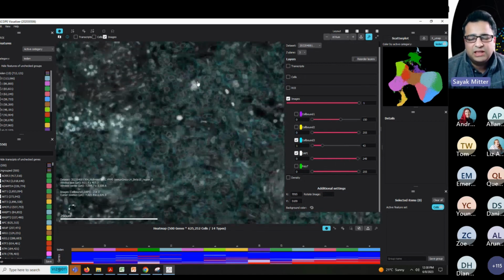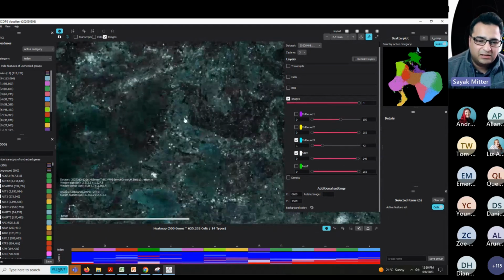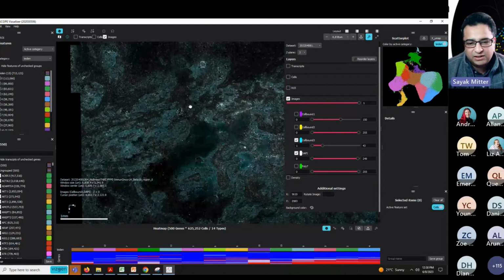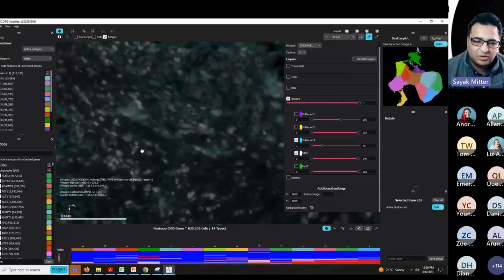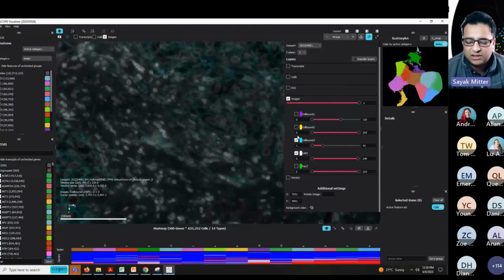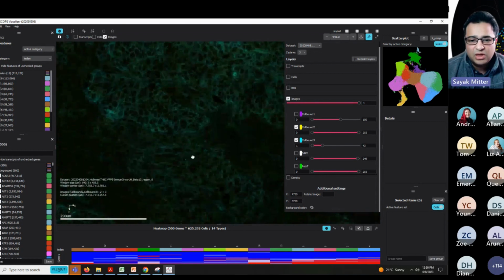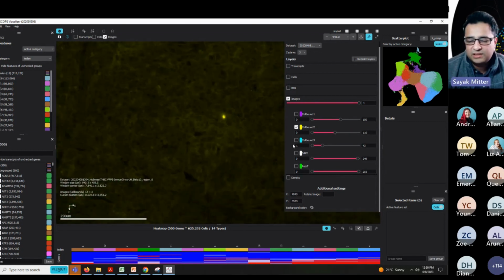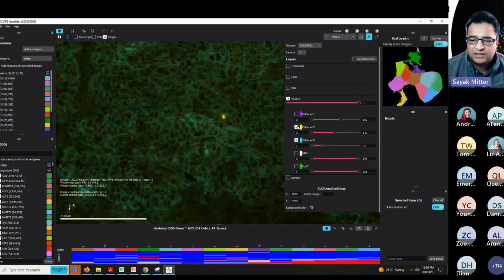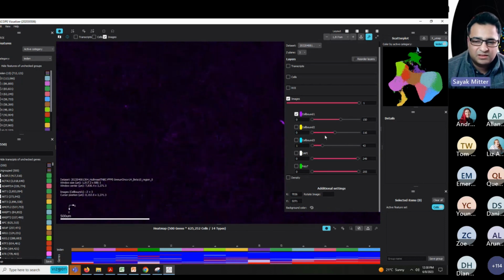So this is an extremely useful target, and I strongly recommend it for people who are looking at samples that have packed tissue cells. The cell boundary stain kit from Vizgen is very good at staining and helping with downstream cell segmentation. Here for the breast tissue, we can see cell boundary stain 3, as well as cell boundary stain 1 and cell boundary stain 2, which may not have performed as well as cell boundary stain 3. But the other stain that has performed really well is cell boundary stain 1 in magenta.